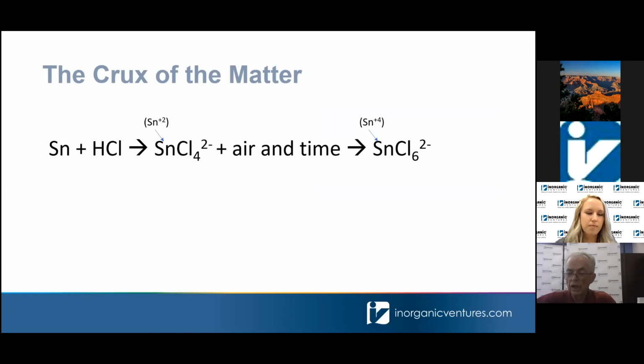When I started working in the reference materials industry, I noticed that tin was available commercially largely as the chloride. The use and popularity of tin in nitric acid wasn't there because of the stability. But as people became more familiar with HF, we started producing tin from the get-go in nitric trace HF. You don't need an excess of hydrofluoric acid to keep your tin in solution.